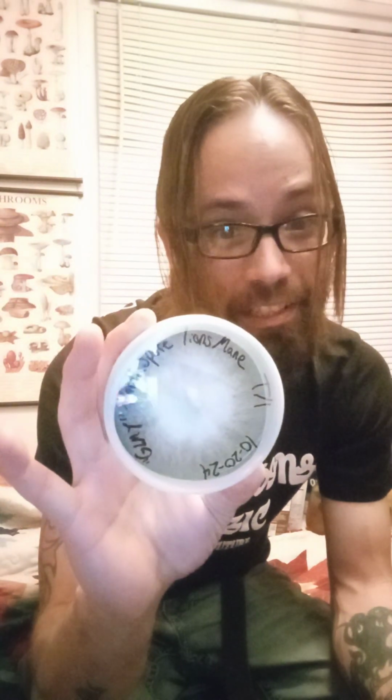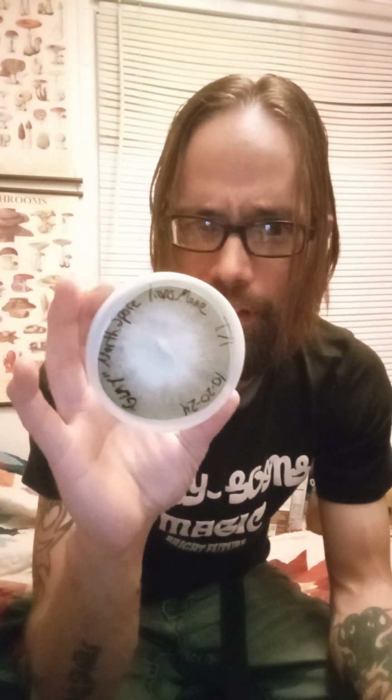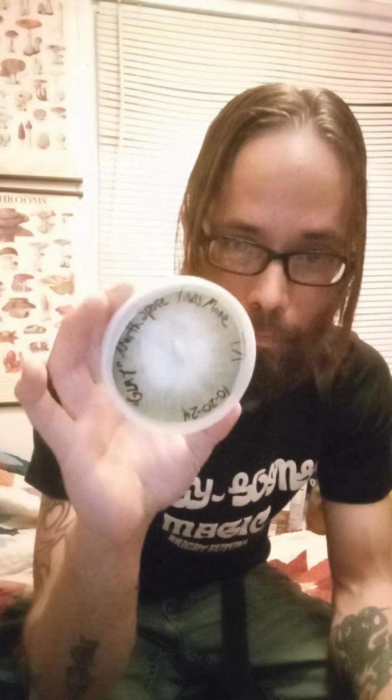That's pretty dense. I mean, it liked it. It did far better than I think I did on PDA for the other plates when I pulled these transfers. This is going to be made into spawn here. Then this is Northspore's lion's mane. Good culture. But yeah, it's like these different little experiments and the way things respond and the way that I rotate.